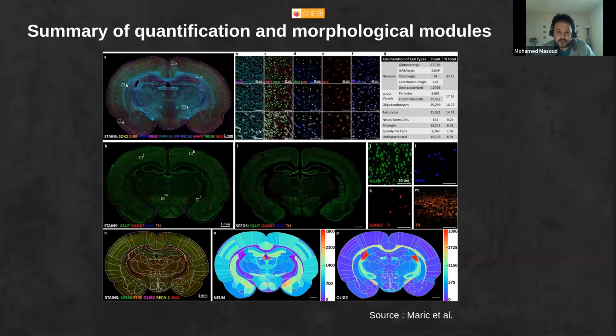It consists, in the beginning, of partitioning the brain, and then after we complete the imaging, we need to reconstruct and complete the image mosaic. Based on the layers that we can construct, we can also complete our data set for analysis. So this is what we have.